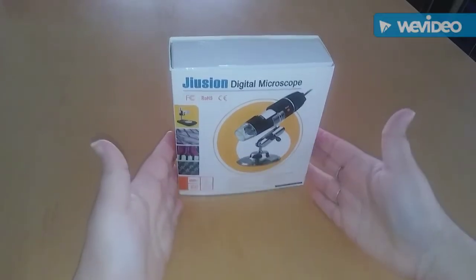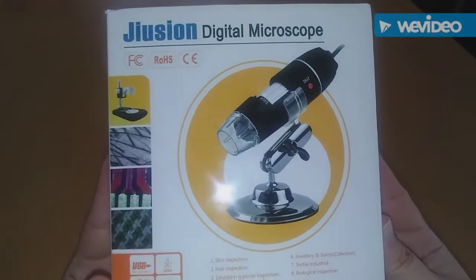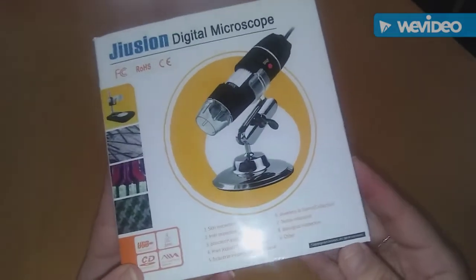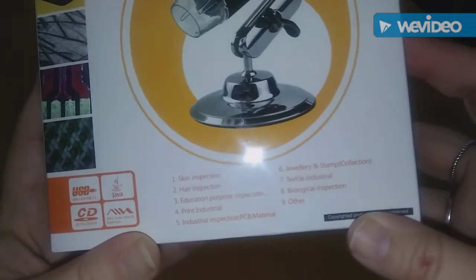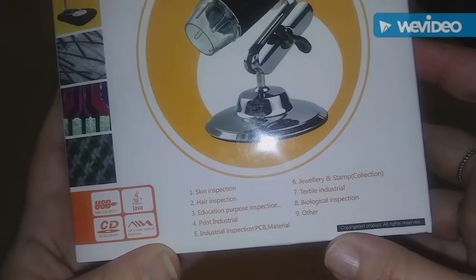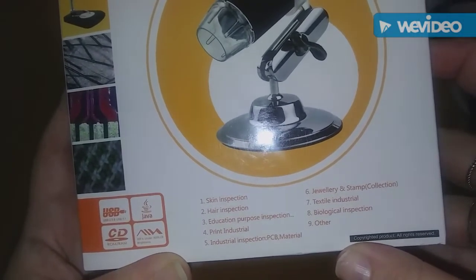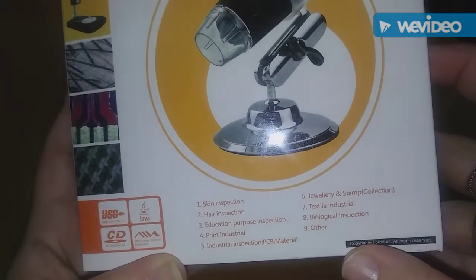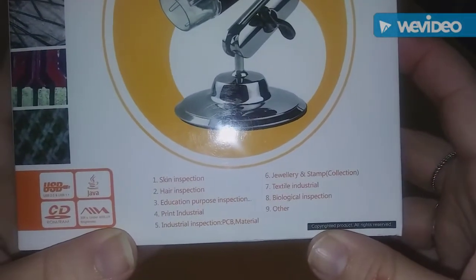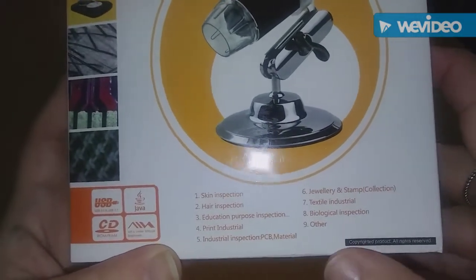Hi guys, I'm reviewing this digital microscope here and it goes up to 1,000 times zoom. It says you can inspect your skin, your hair, educational purpose inspection, print, industrial inspection, material, jewelry and stuff. Textile, biological inspection and several other things.